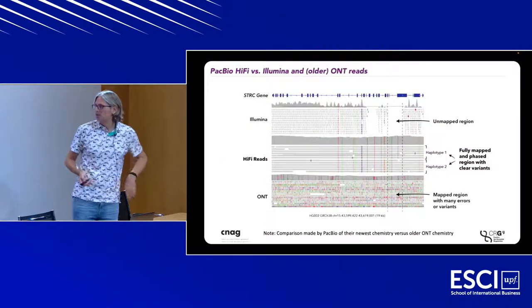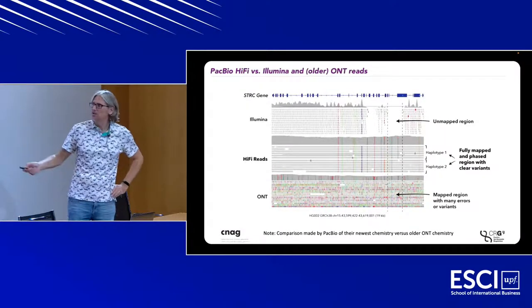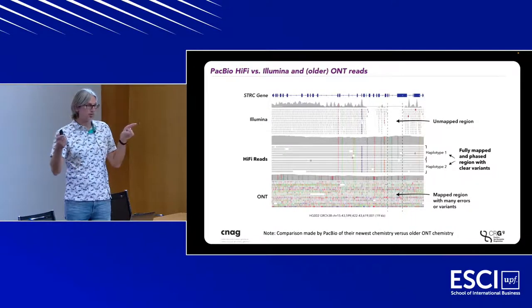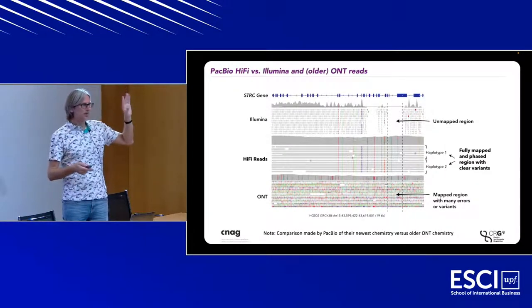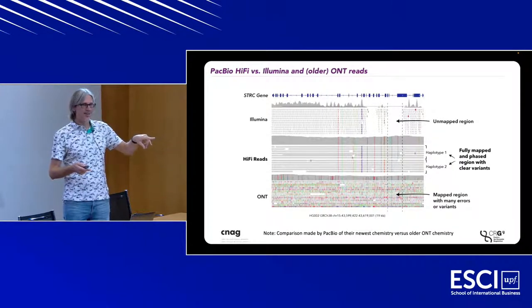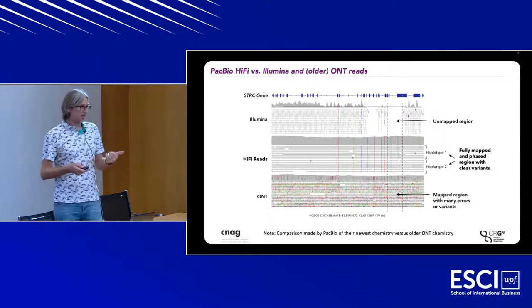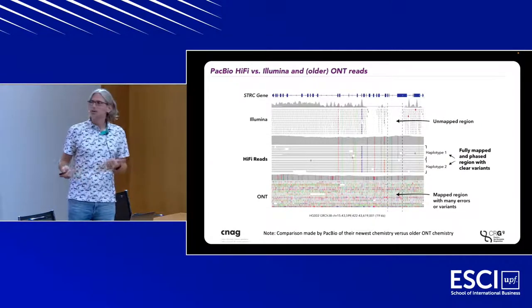So what does it look like if you align these reads back to the genome? This is a shot from IGV. IGV is a browser. Who's used IGV? One person has used IGV. Okay. It's really good. Everyone should learn how to use IGV or something similar, okay, to browse your genomic data.